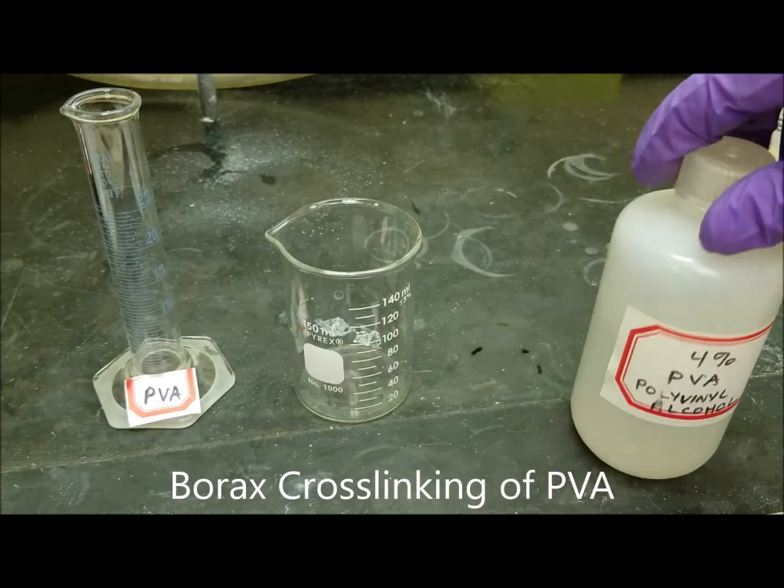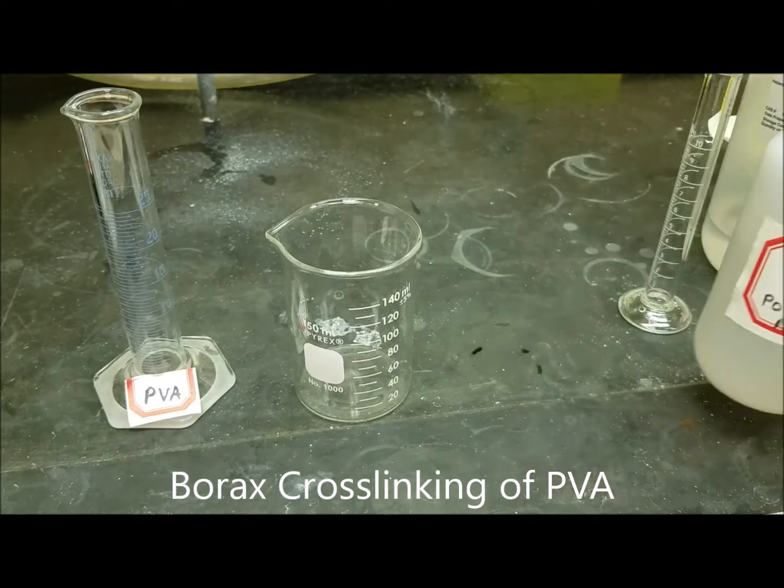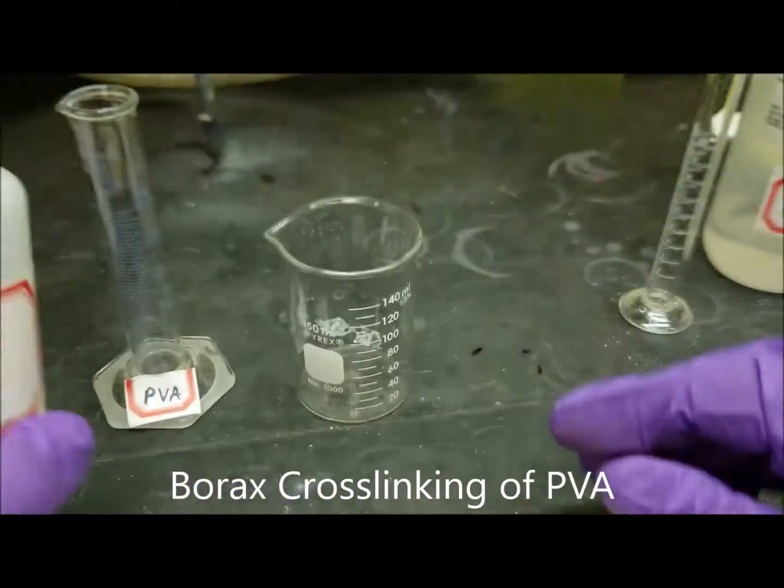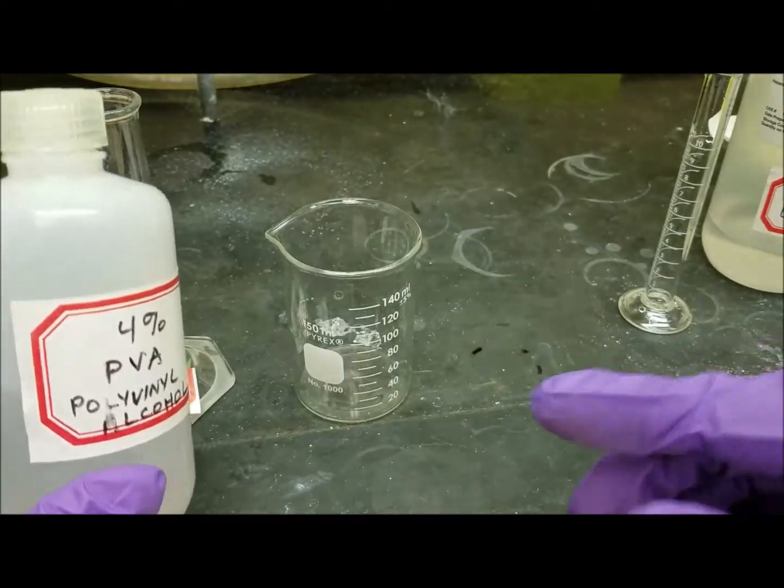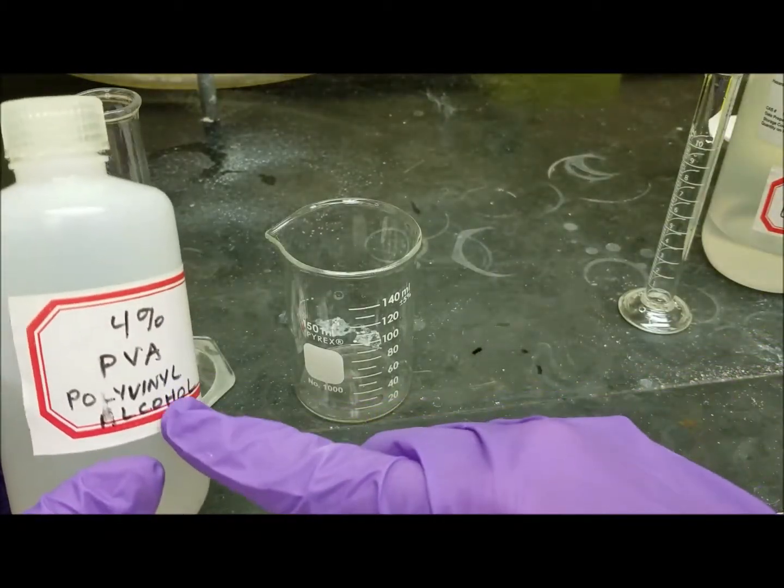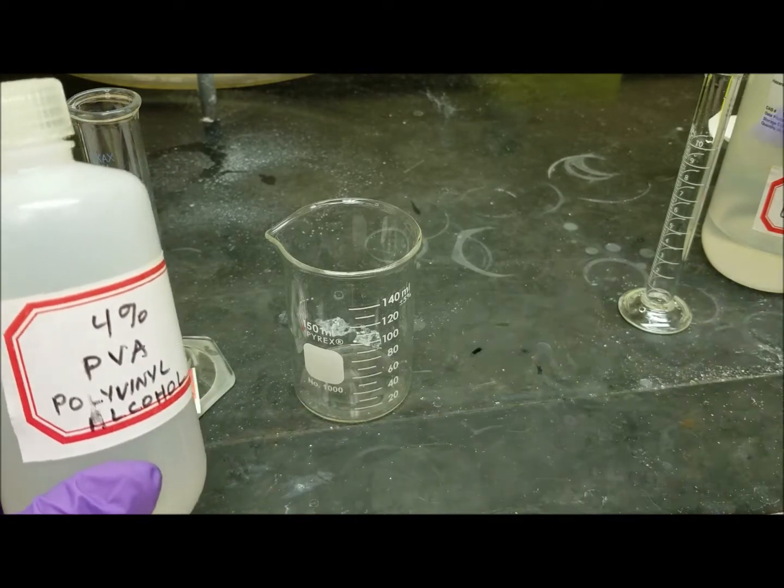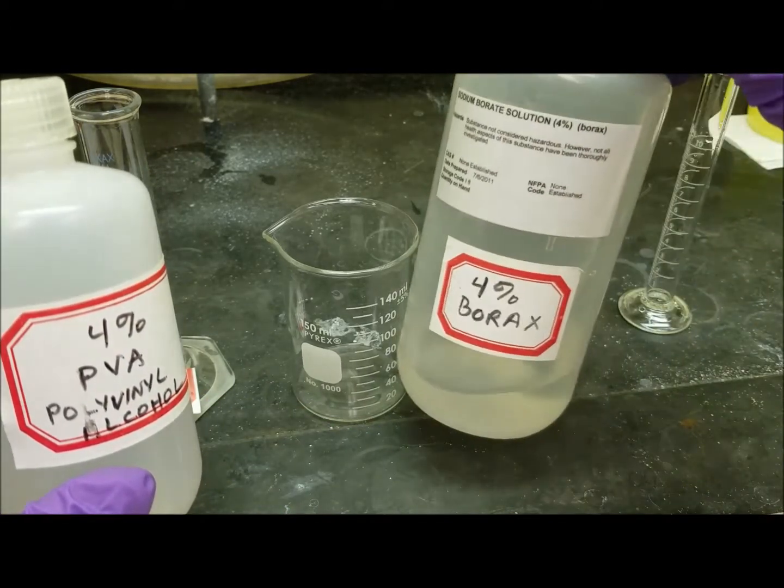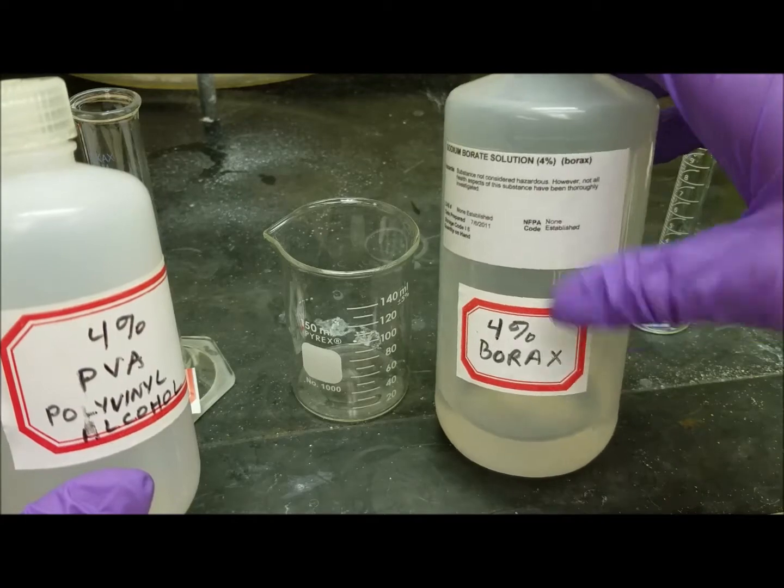Here's the last little bit for this experiment and this is the preparation of a cross-linked polymer of, basically it's polyvinyl alcohol is our polymer and we're going to cross-link it with sodium borate, also known as borax.